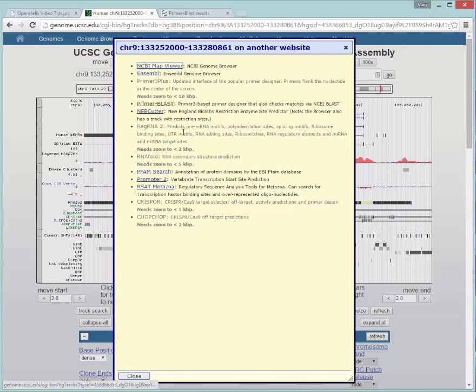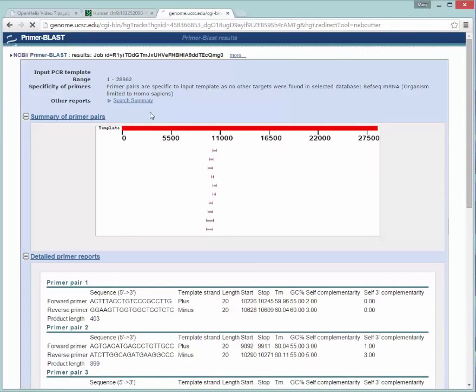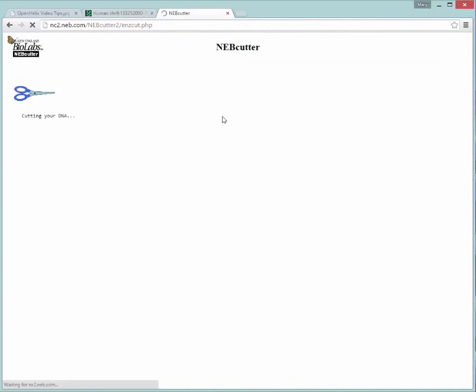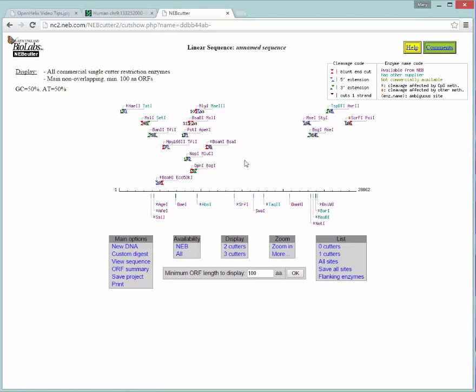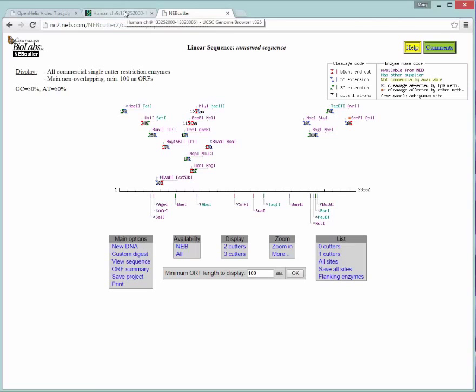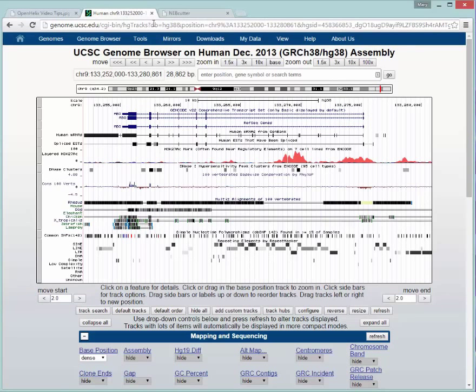Another one I'll try just quickly is the NEB Cutter. You can actually look at the restriction enzymes in the UCSC Genome Browser, but you might like this graphical representation here at NEB to look at potential restriction enzymes that are cutting in the region that you're focusing on. In this case, the one that we sent from the UCSC Genome Browser.